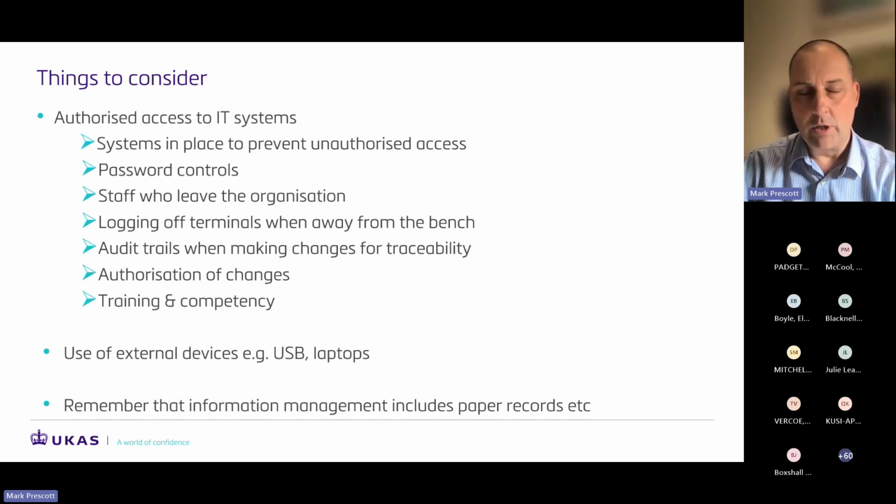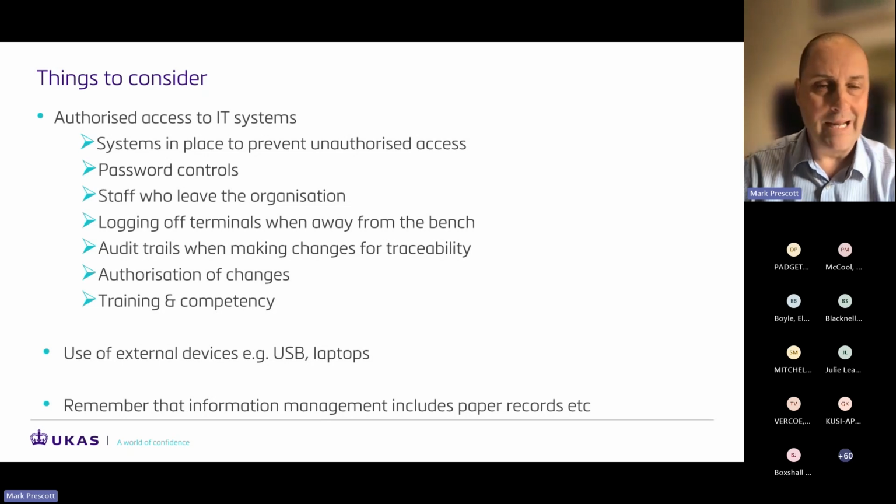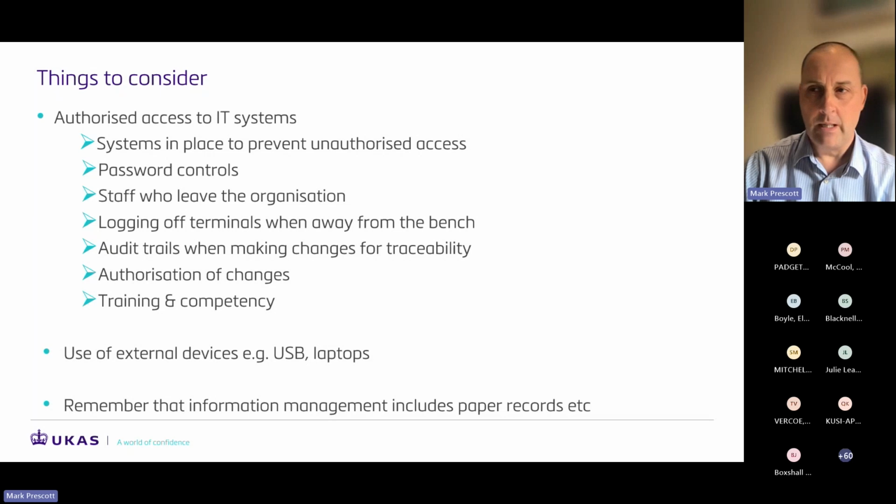If I'm looking at personnel on an assessment as part of the QMS, I may well want to see that someone who's left the organisation recently has had their access to the system removed. Obviously, they'll still need to remain on the system for audit trail purposes, but it is worth checking that there is a process to prevent access for staff who've left.